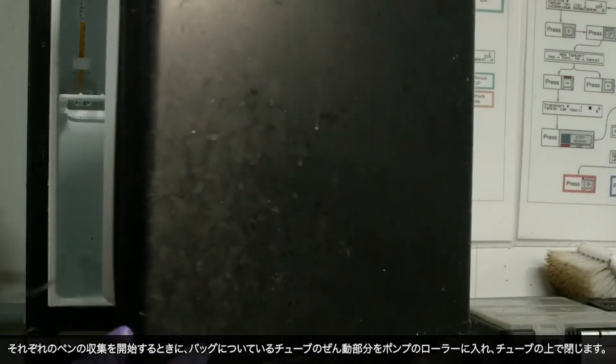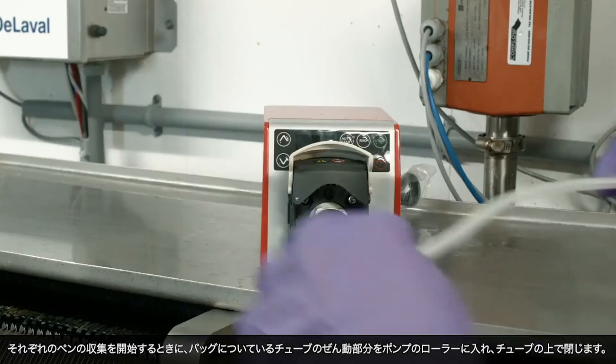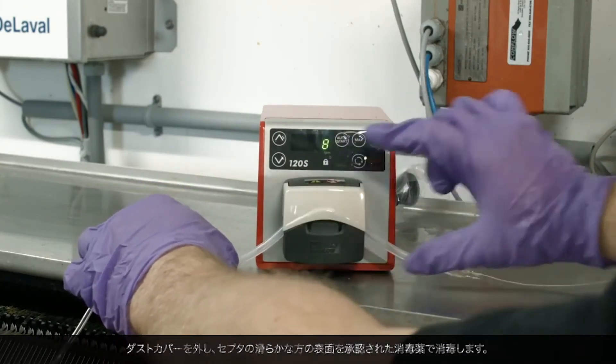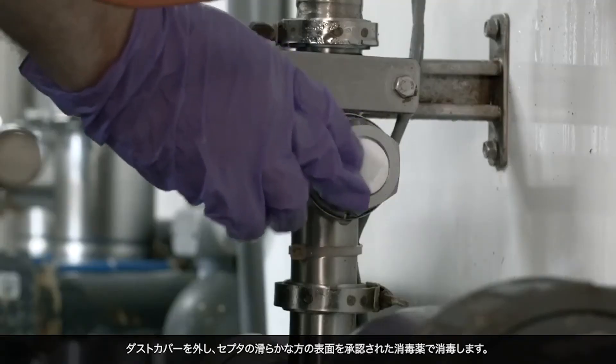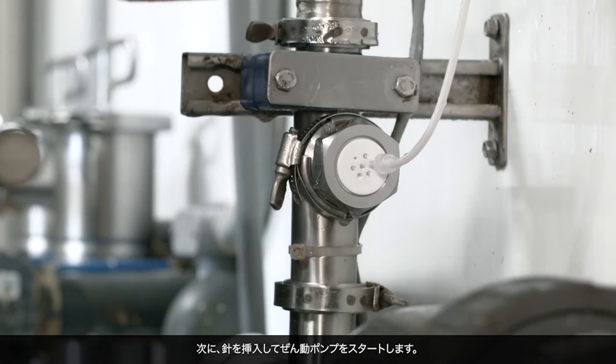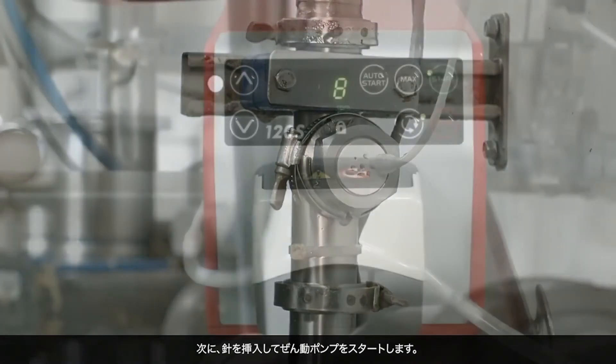At the beginning of each pen, place the peristaltic section of the bag tubing into the clamshell pump roller and close over the tubing. Remove the dust cover and swab the smooth surface of the septum with an approved sanitizing agent. Next, insert the needle and start the peristaltic pump.